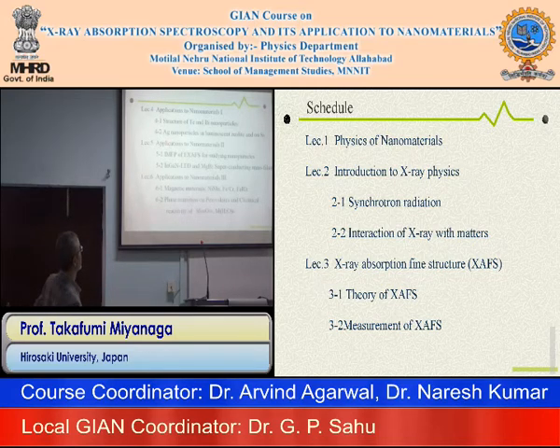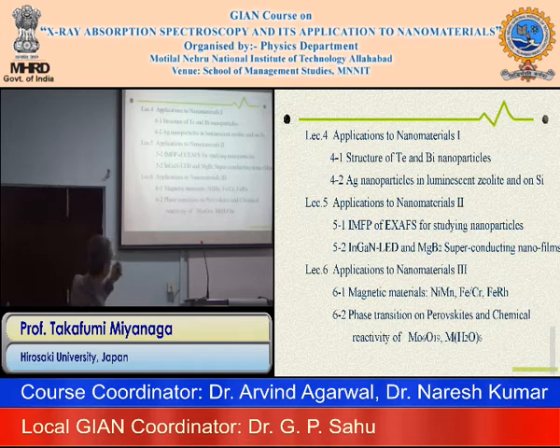So I showed you the silver nanoparticles changing the local structure as a function of particle size, and another interesting application, the luminescent zeolite. This means silver metal nanoparticles show some optical luminescence. This is also a social application from the nanoparticles.